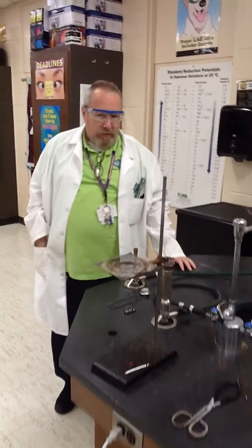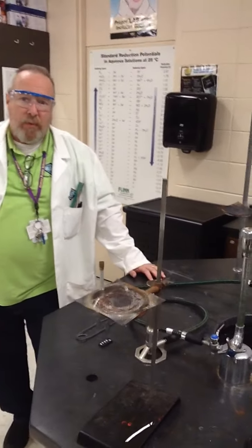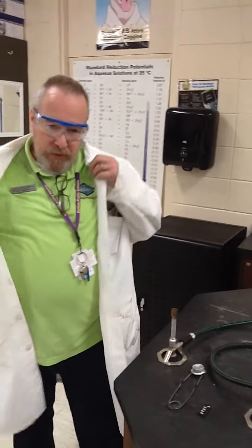What I want to show you is how to light a Bunsen burner and how to boil water. And what we'll do later is finish our experiment, and I will have copies of the lab. I don't know about doing any video editing, but I will attach in similar files copies of the lab with explicit instructions on where to record the data, and I'm going to demonstrate how you would have done it if we could meet at school and perform our lab. But this is a poor second, but I hope it'll be okay.